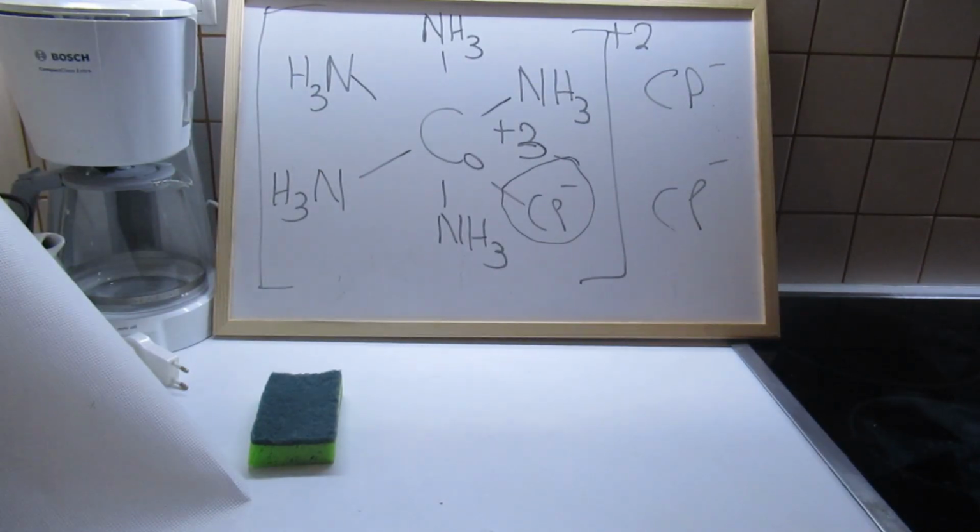So that's why we have two chloride counter ions. So that being said, let's get cooking.